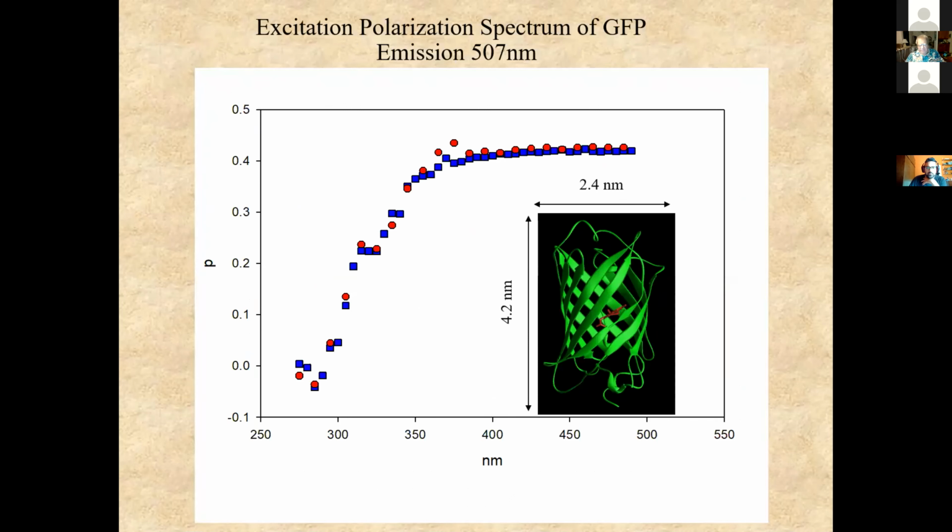Here's GFP. I'm sure many of you have probably never seen this. I do this in my lab, where you normally excite, of course, in the visible where you have a high polarization, not 0.5, only about 0.42 or something, but you can go lower.